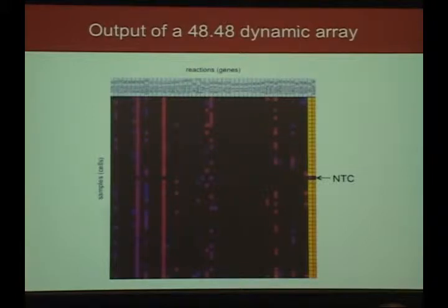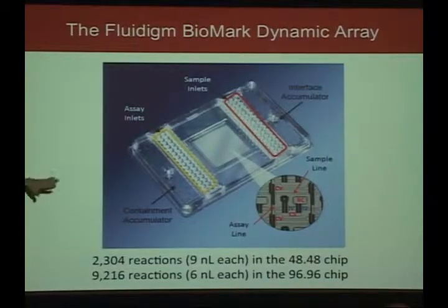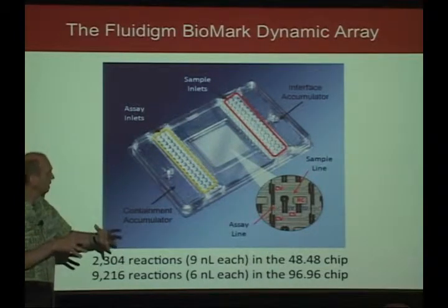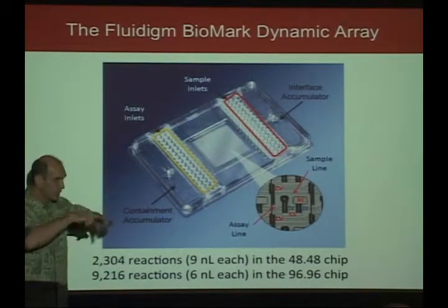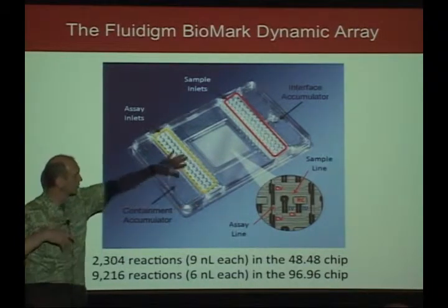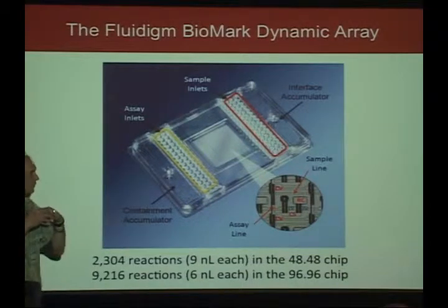Does this actually go through the cycling to amplify the... Yeah, that's a good point. I should have mentioned. When you have this chip, you first load it into one part of the instrument, which is basically making all of the combinations. So it opens and closes all these little microvalves and creates all of the reactions.